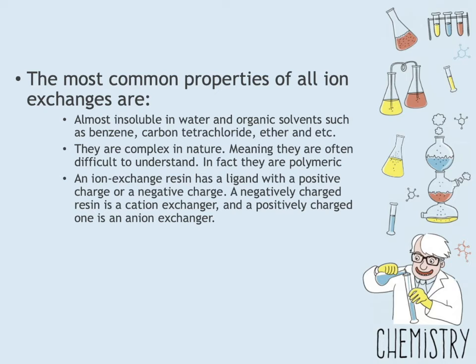They are also very complex in nature, meaning they are often hard to understand. You need to have a better understanding to fully grasp the idea of the ion exchangers. In fact, they are polymeric.